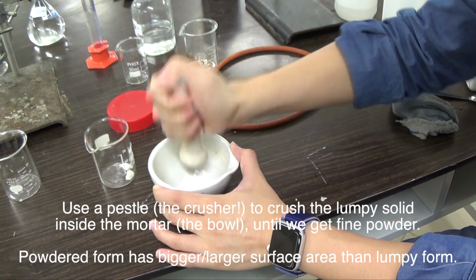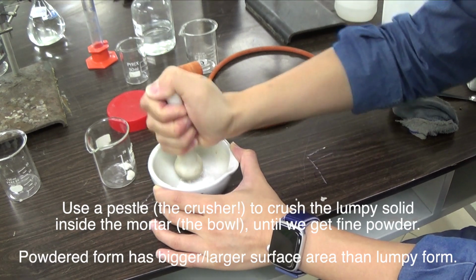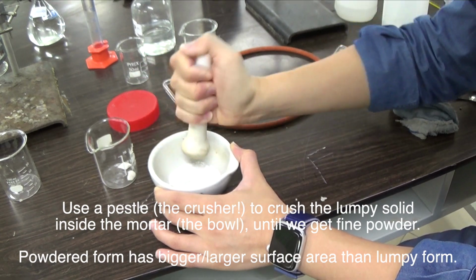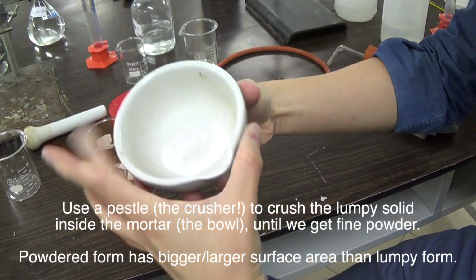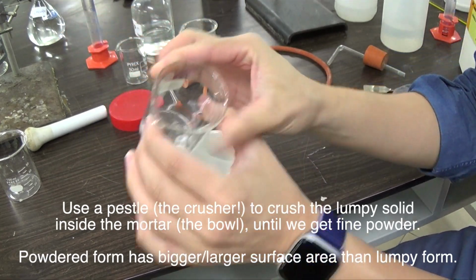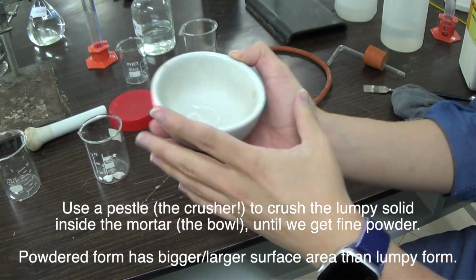That's good. As you can see now, they are the powdered crushed form. This is still the lumpy, L-U-M-P-Y, solid. This is the crushed solid.